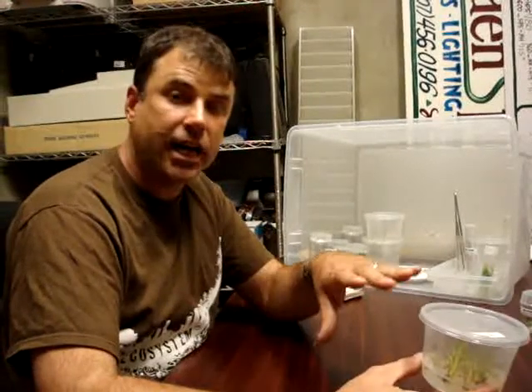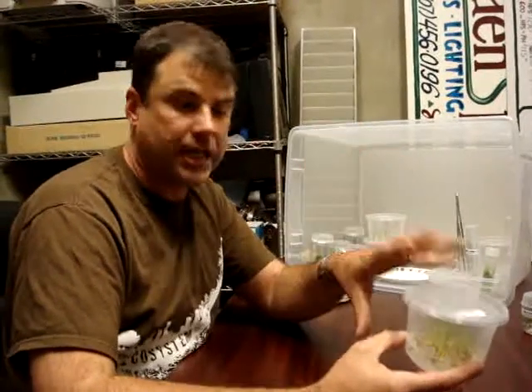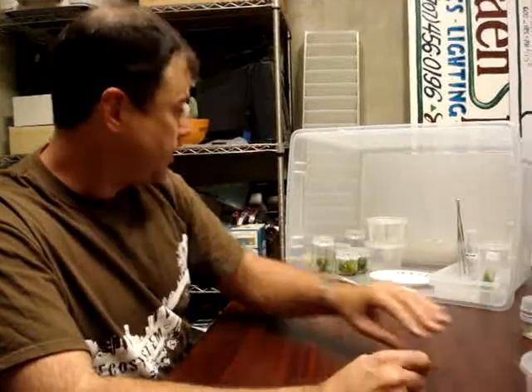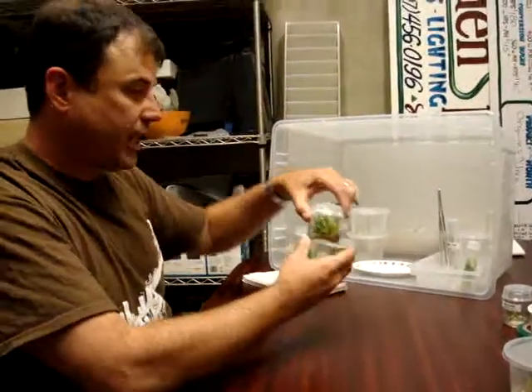Because it saves energy, it saves space, it saves time — these things take care of themselves. When the plants are put into the container, they are not handled again until they're taken out of the container. This tub was taken from a jar like this.